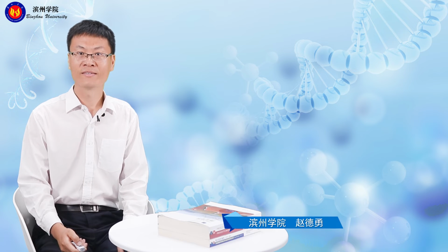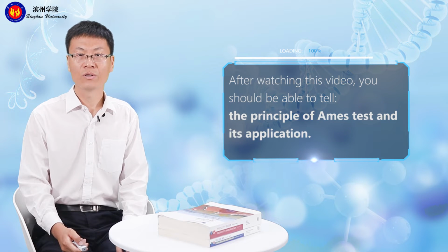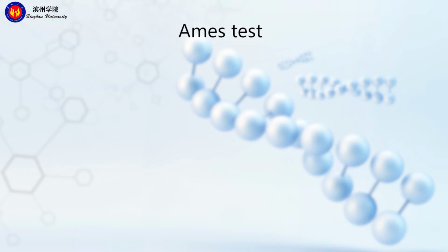Hi everyone. In this section, we will talk about the Ames test. After watching this video, you should be able to tell the principle of the Ames test and its application.